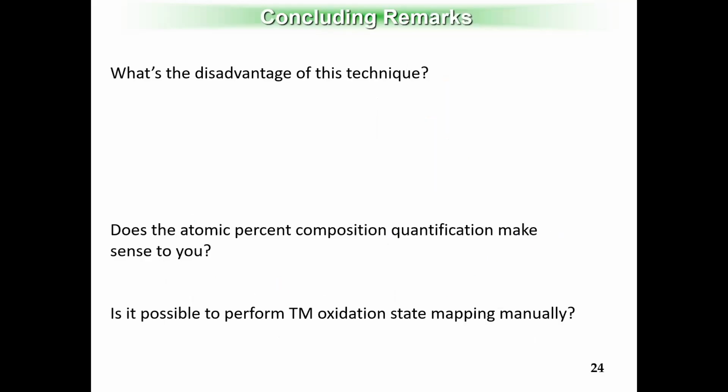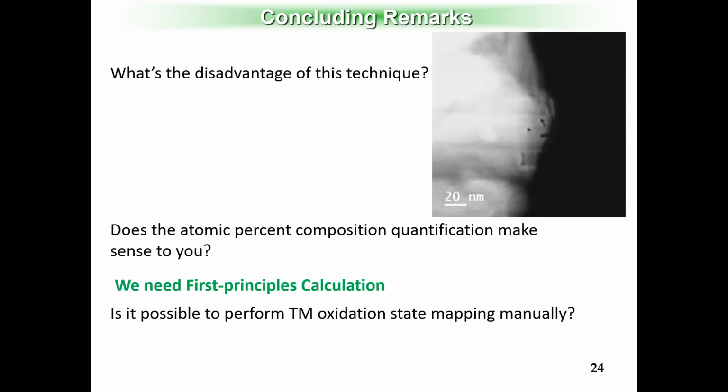So this will be my last slide. To finish, although I introduced a lot of advantages and why you want to do the TEM experiment, I want to remind you that there are also some disadvantages of this technique. First of all, the damage, right? You can see that this is for sensitive materials. If I don't use the cryo temperature, you can see damage, those holes generated by the electron beam in the STEM mode very easily.